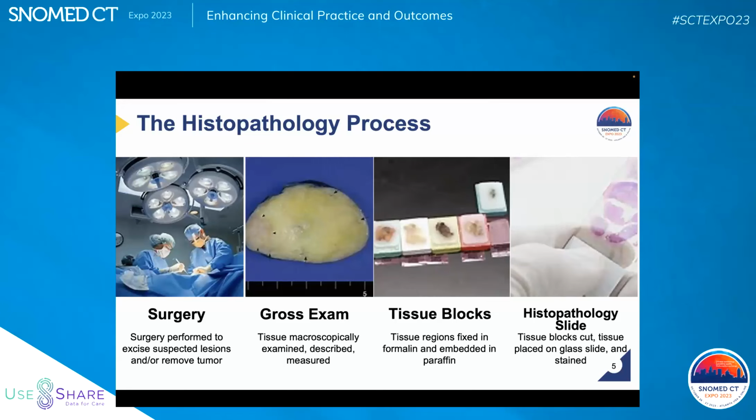And the pathology process continues. So basically you have this part, and depending on how big it is, people like Eric will excise components of this large piece of tissue and put them in jars of formalin. Formalin stops the metabolic process. So basically everything freezes, all cells freeze where they're supposed to be. And it sits there for, I forget how many hours per inch of tissue, but 4 to 8 hours, something like that, to stop the metabolic processes.